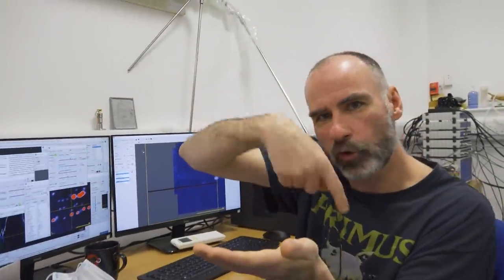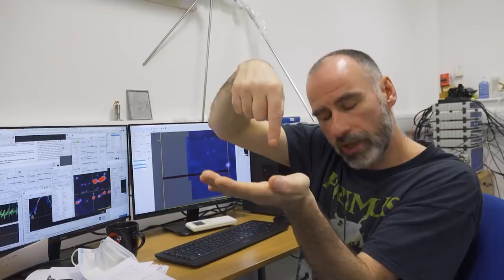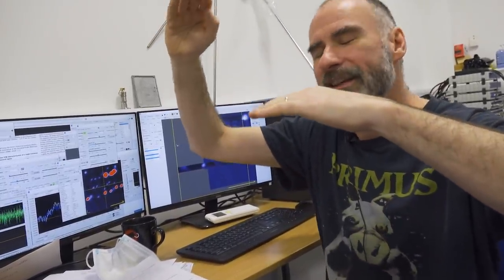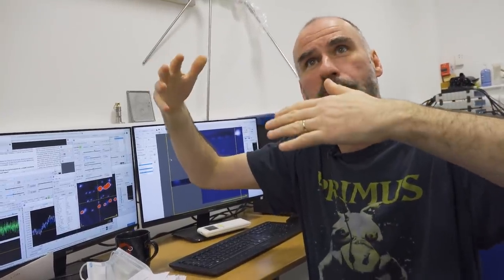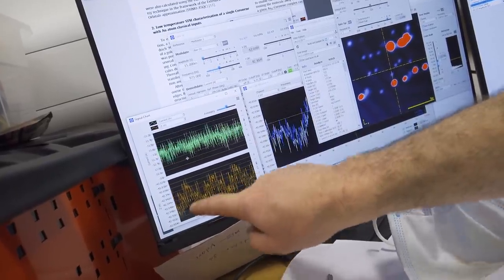So the tip's moving back and forth, and we're telling it to keep the current between the tip and the sample constant. To keep that current constant, it has to move back and forth and follow the topography of the surface. Because it's a feedback loop, it's comparing the value of the current it's measuring against the value of the current you want, which we call the set point current. That feedback loop has a certain response time. So if you drive past the point at which the feedback loop can respond, it can, at worst case, crash. So, yeah, this is the tunnel current that it's measuring, and this is the motion of the Z.